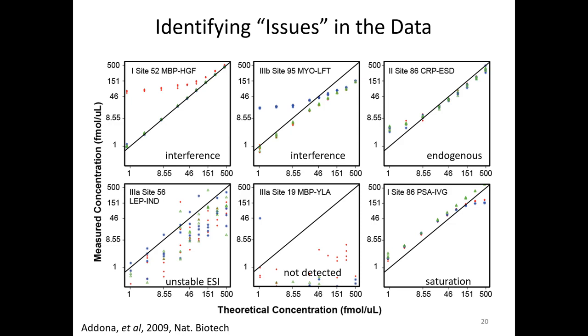So that is detector saturation. The reason that it's obvious to me is because I know more about this plot than you. The red, these are color-coded. The red transition is the most intense transition, followed by the blue, followed by the green.